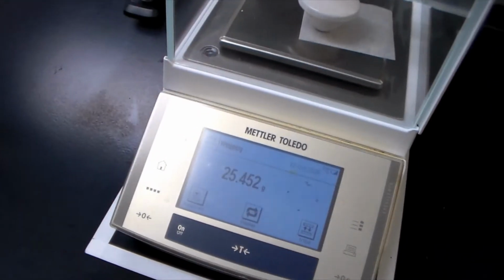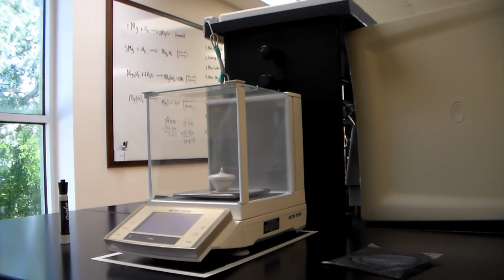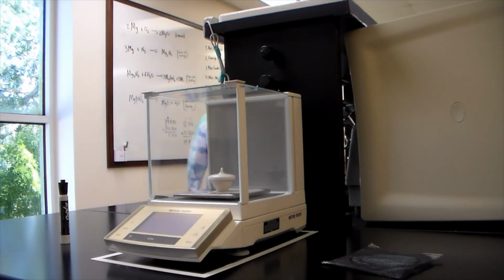Determine the mass of the oxide and the empirical formula. Place the oxide in the appropriate waste container. Wash and dry the crucible.